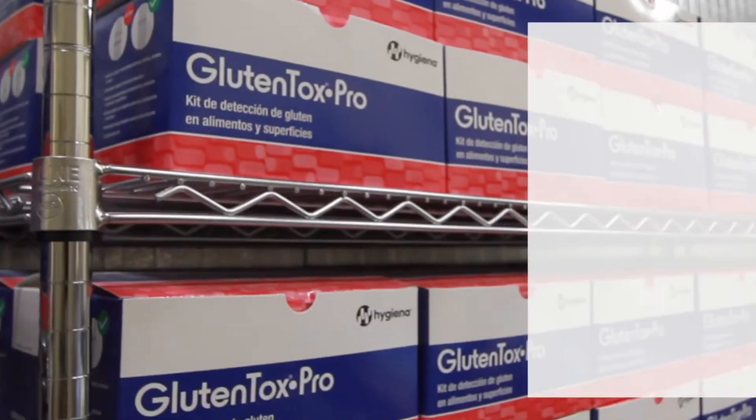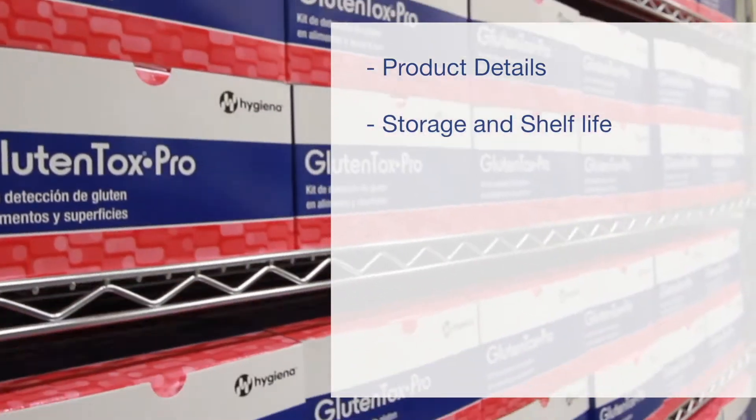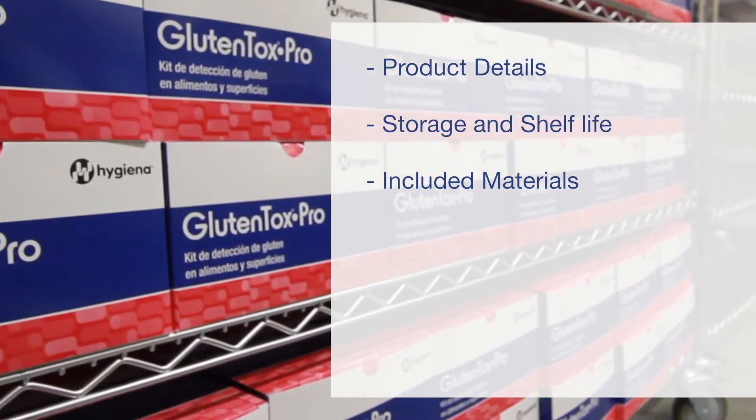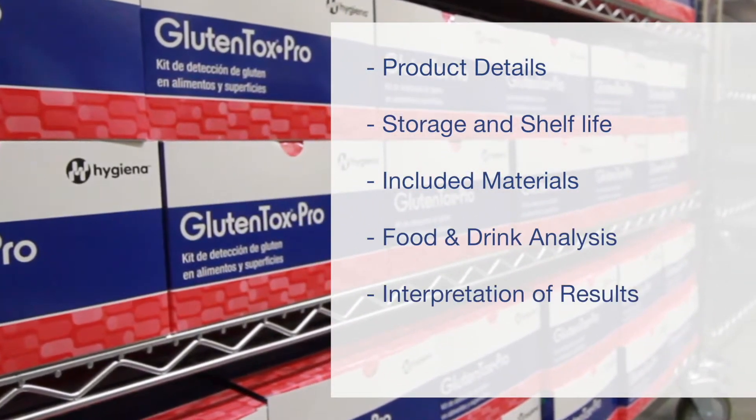In this video we will cover product details, storage and shelf life, included materials, food and drink analysis, and interpretation of results.